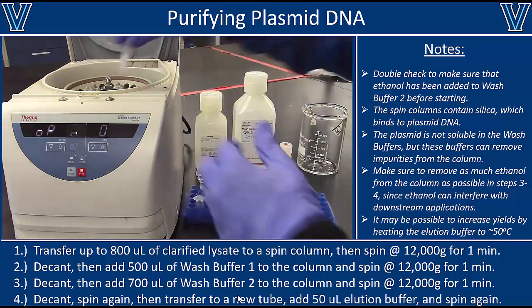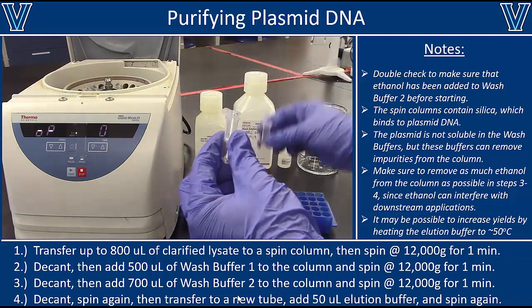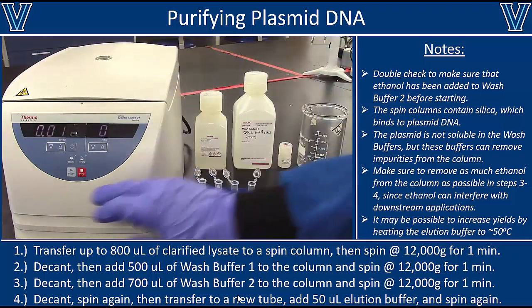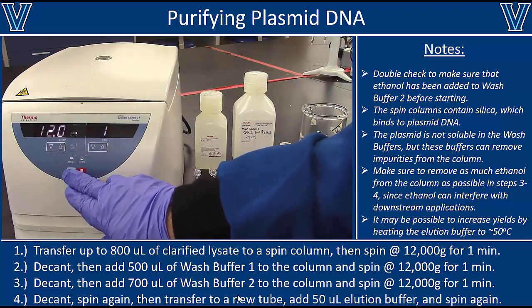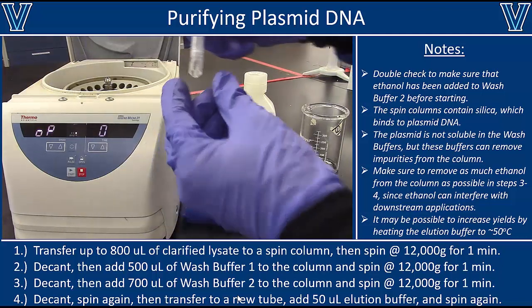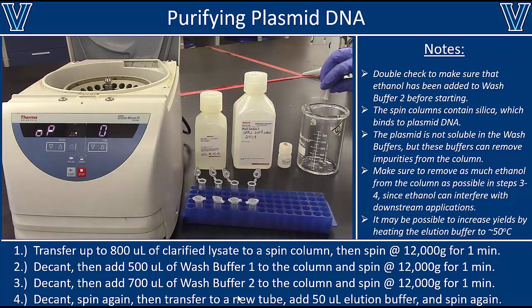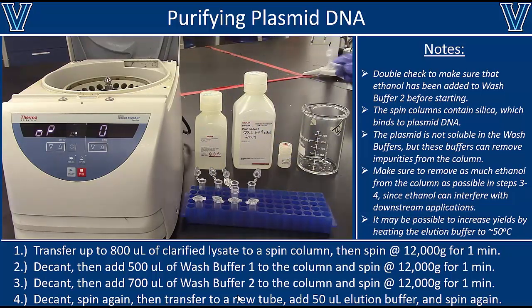All right, so you want to repeat that for all of your samples, and then centrifuge again at 12,000 G, but this time just for 1 minute. Once that spin is done, you should get something that looks like this. The liquid has gone through the column. You can now decant that liquid into a waste beaker, and then repeat that for the rest of your samples.